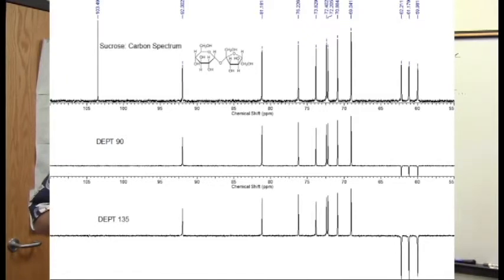Looking at the DEPT-135 now, remember DEPT-135 will have carbons with odd number of protons, CHs and CH3s, with their peaks pointing up. Here we see all eight of the peaks in the DEPT-90 are also up in the 135. There are no additional peaks up, no methyl groups in here. All eight peaks that are up in the DEPT-135 are indeed methines, CHs. These three peaks are now large again and inverted. They are upside down. Those are clearly three CH2 groups.